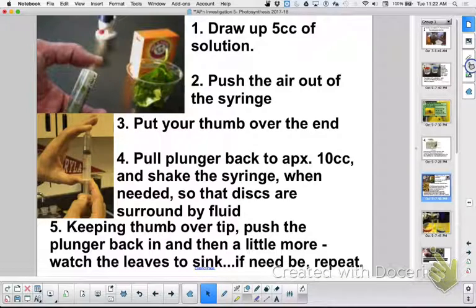So this is what you want to do. You want to have your light, and don't put the light over your cabinets like these people did. Put it on the center ones and out and away, because these cabinets you may want to get in and out of, and these will stay shut, right? Because these are my cabinets, there's nothing in here for you. These lights normally go underneath here. So you're going to want to let them sit and cool, so you don't need to put them away, but that's where they came from, under here.